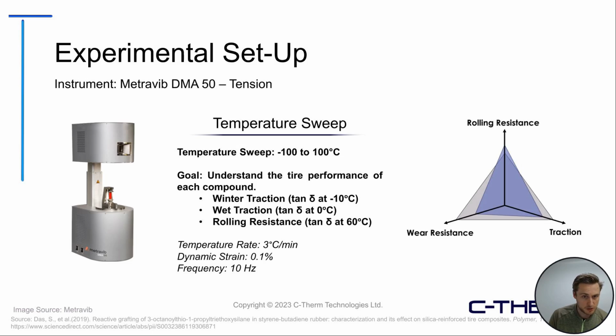So you'll typically see this in industry as well, where they just understand how the materials are predominantly loaded, and then reverse engineer that to get a driving frequency.